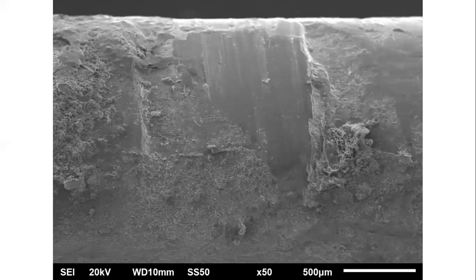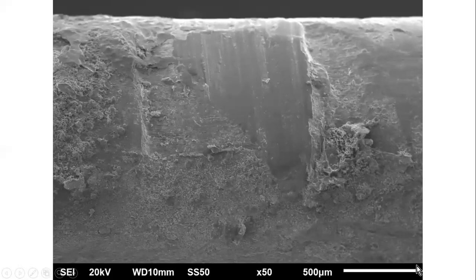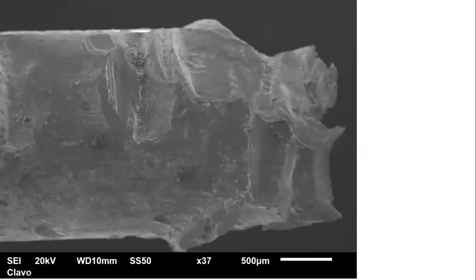Here we can see the difference between the rust and the clean nail. Here is a part of the clean nail, and everything else is made of rust or oxide, as you may know. Here you can see also the magnification scale, so this is a scale of 500 micrometers. This is the voltage that was applied, 20 kilovolts. The nail was made of some kind of steel, as I already told you, and so it was kind of hard to cut, as you can see here.